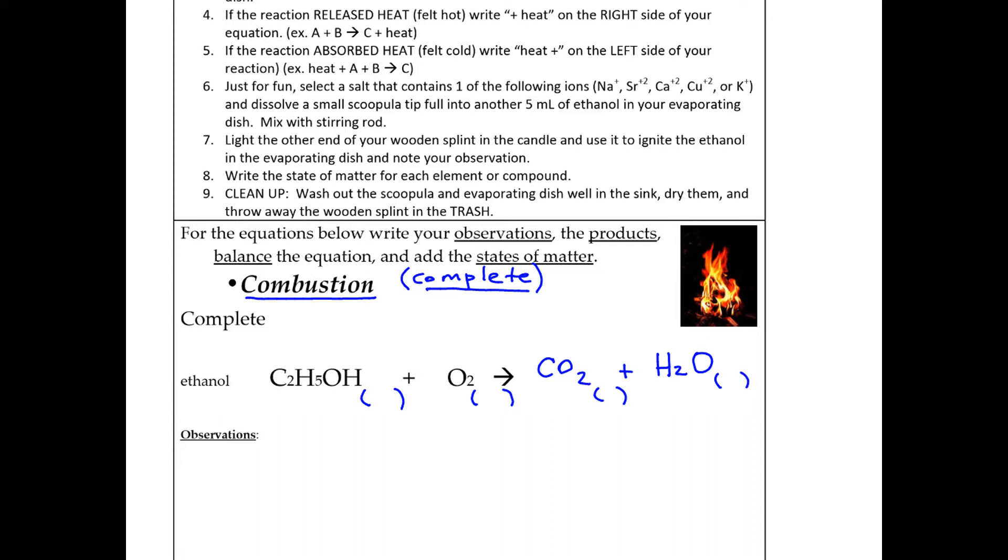And you should be able to understand that there was a lot of heat being released, so of course this is a very exothermic reaction.